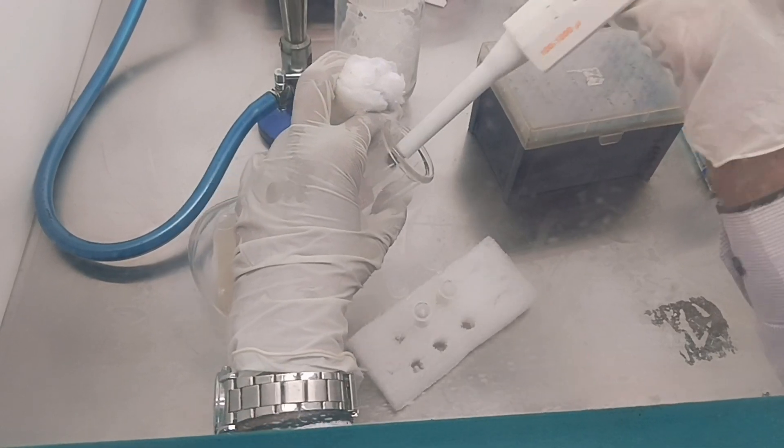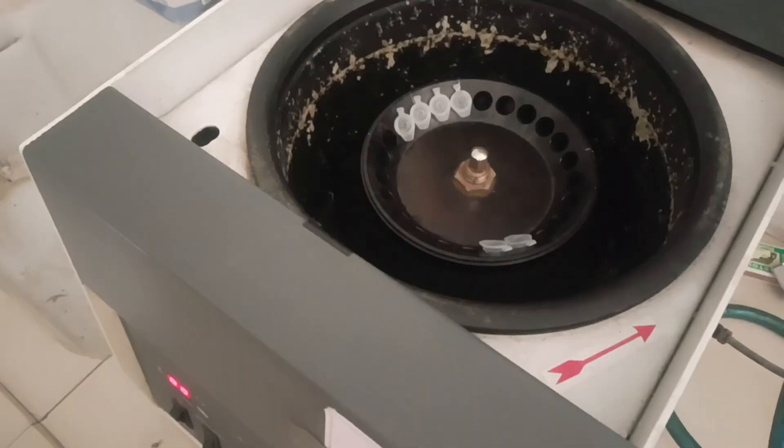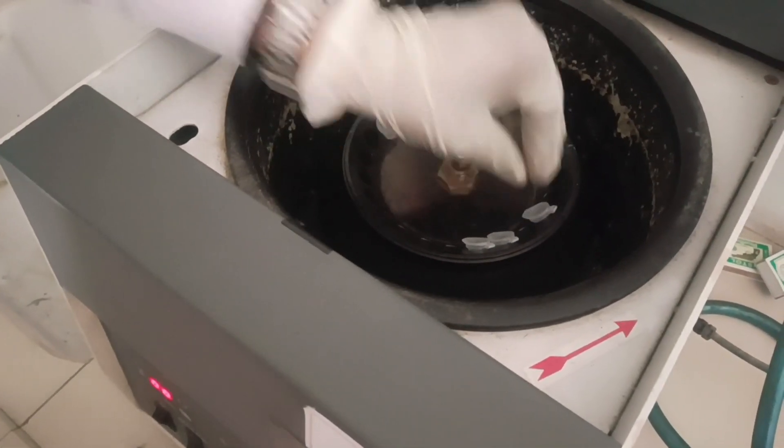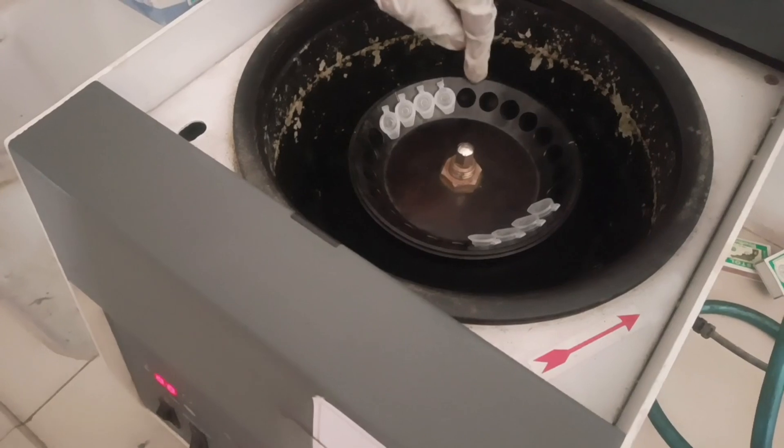Take 2 ml culture in centrifuge tubes. Centrifuge the tubes at 7000 rpm for 4 minutes. Make sure to balance the tubes properly.